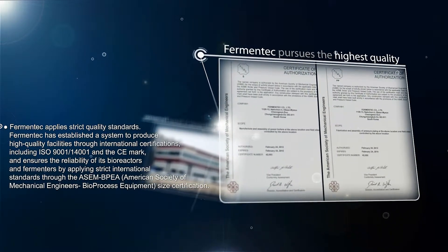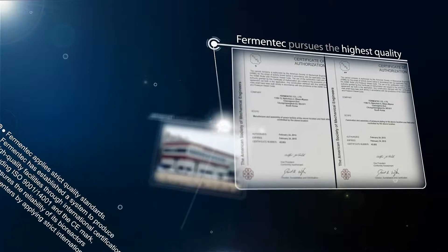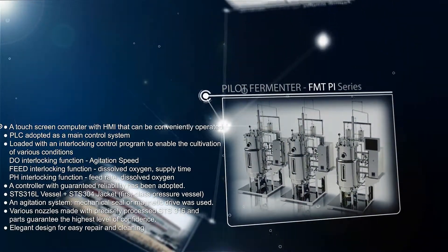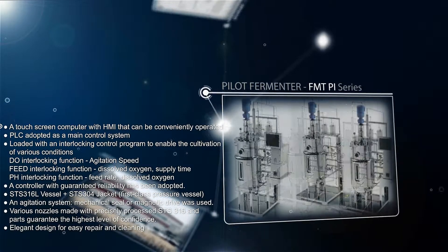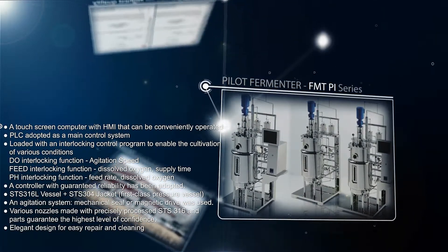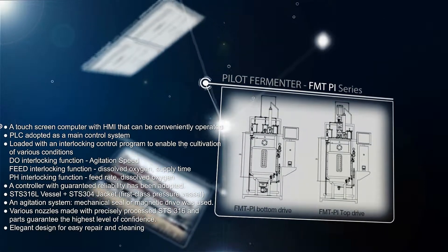Fermentech has built a system to create facilities with superior quality. Pilot fermenters are designed and manufactured to satisfy international standards and cause no corrosion or abrasion, as well as minimize material quality degeneration through delicate processing processes.